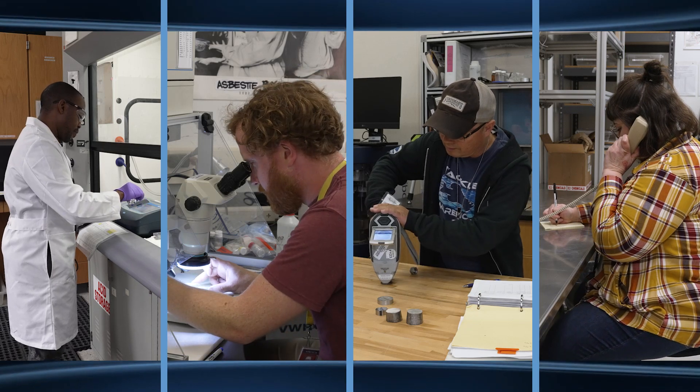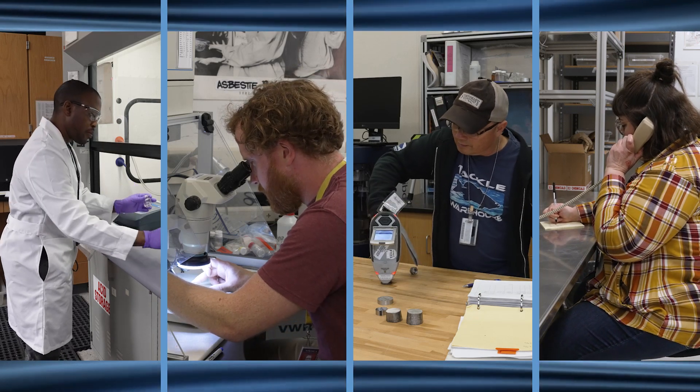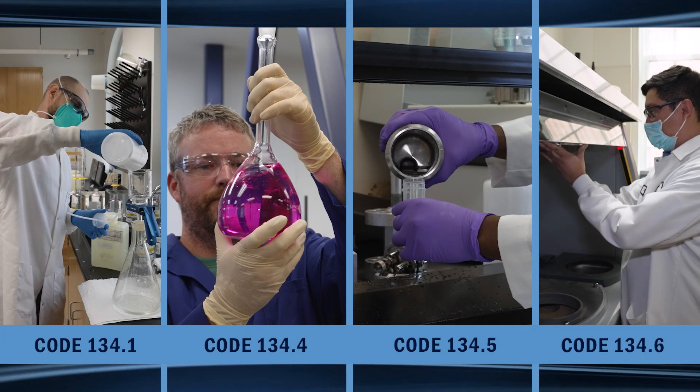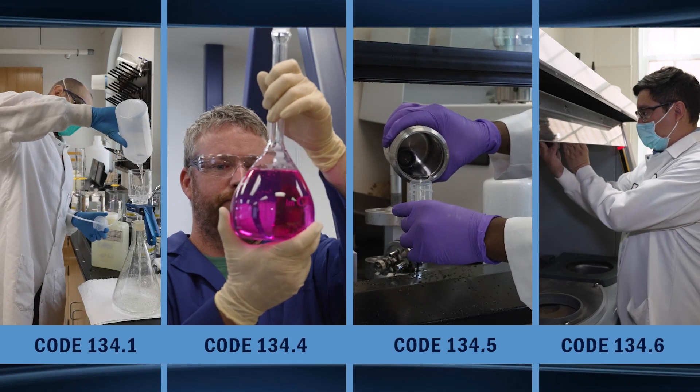Our team is comprised of chemists, chemical and material engineers, technicians, and support staff. This video will give you a brief overview of the four branches that make up our talented laboratory division.